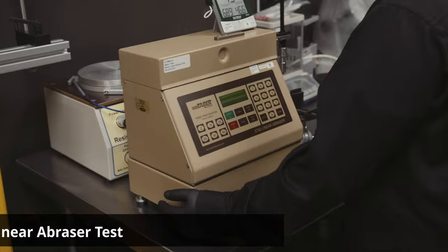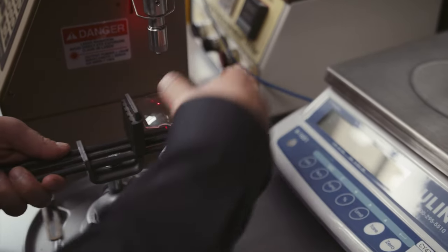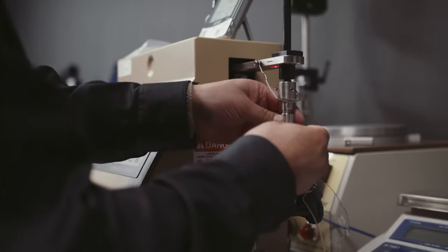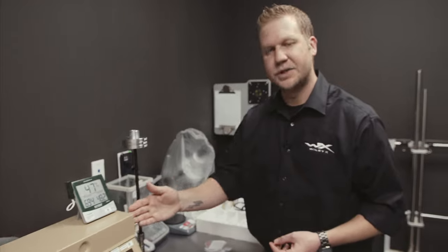This apparatus right here is our linear abrasor. We use a specially standardized eraser that we put on the probe. This probe is going to be dropped on top of the surface of your lens, and this arm is going to go back and forth 20 times.